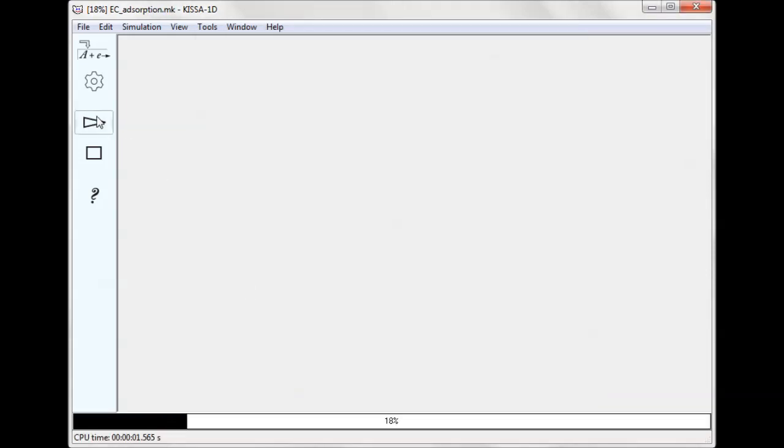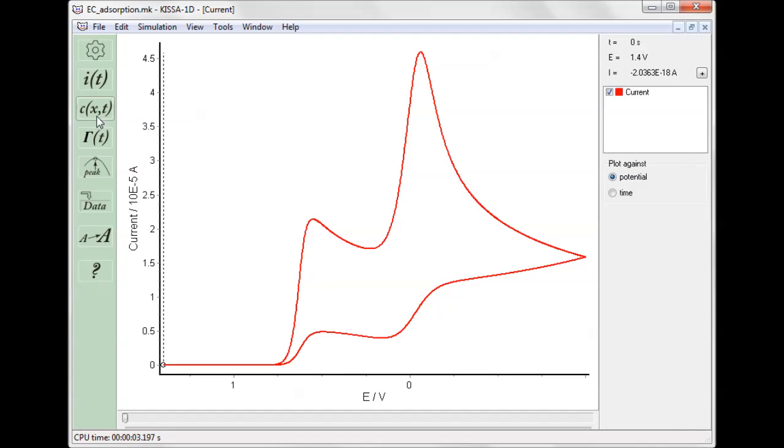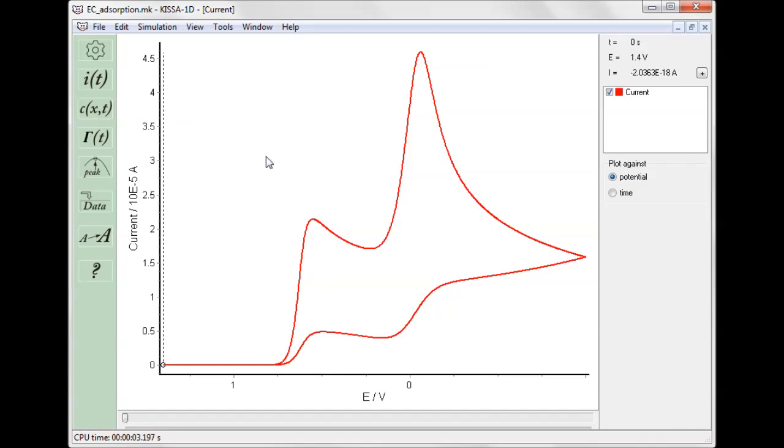Clicking start simulation button launches computations. When they are completed, the electrochemical current is displayed.